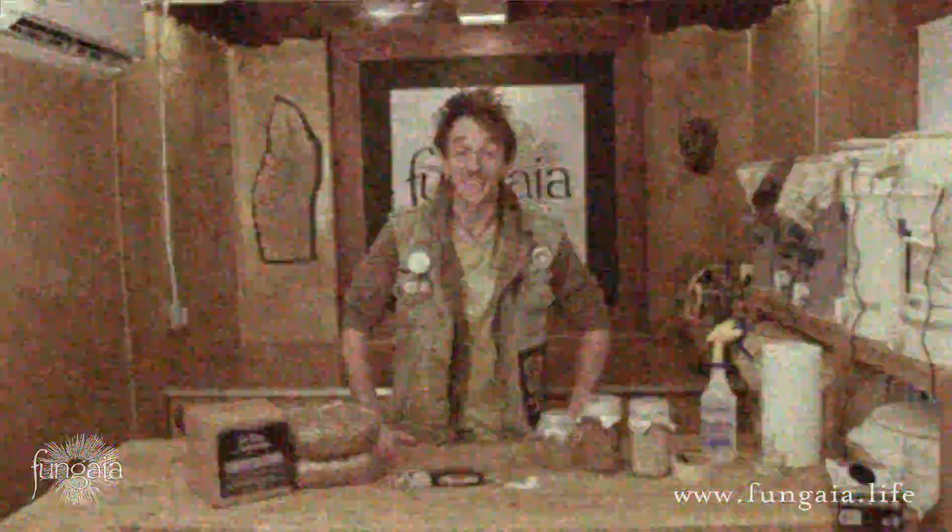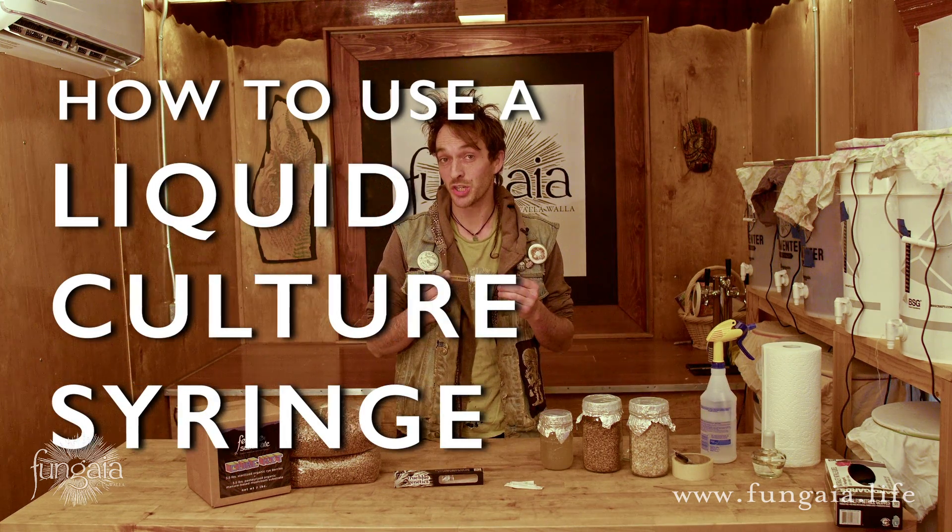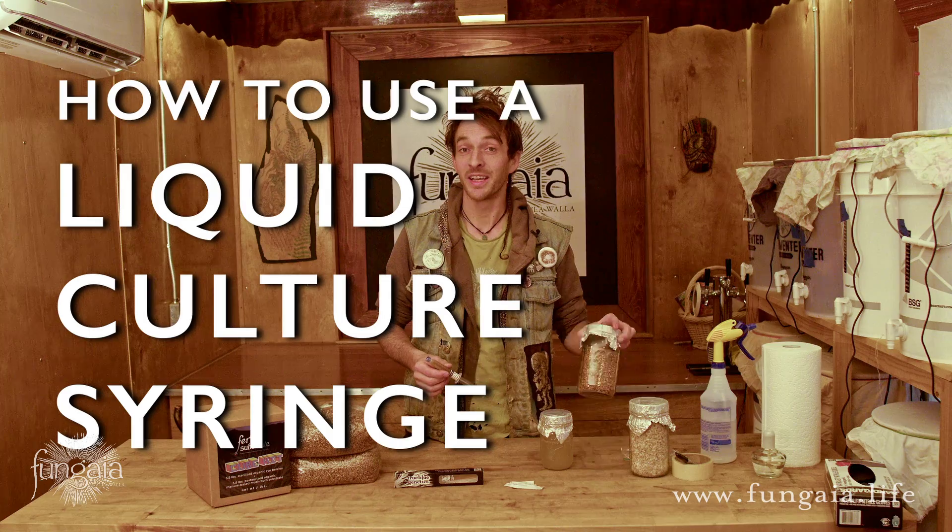Hi folks, thanks for joining me. Today I wanted to make a quick video explaining how to use a liquid culture syringe to inoculate grain spawn for DIY mushroom cultivation.